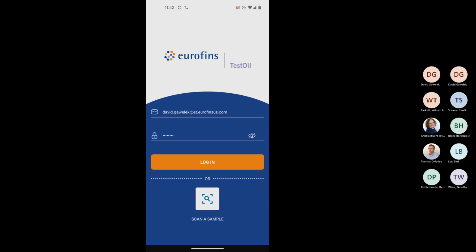So we finished up a little bit early, and I'm happy to sit and answer any questions. Does anyone have anything else they'd like to know while we're talking about AssetLink? All right, one more question. Can editing asset info be controlled by permissions? Can you review that again real quick, Dave?